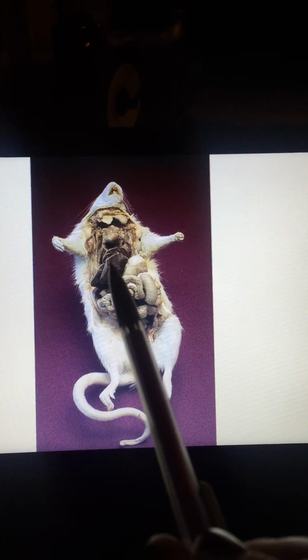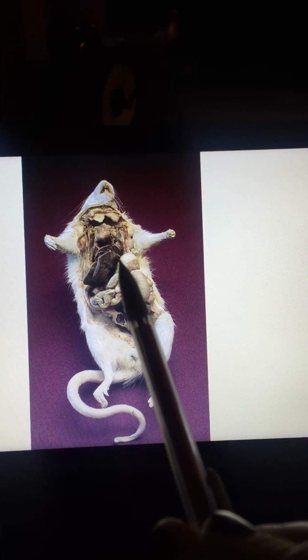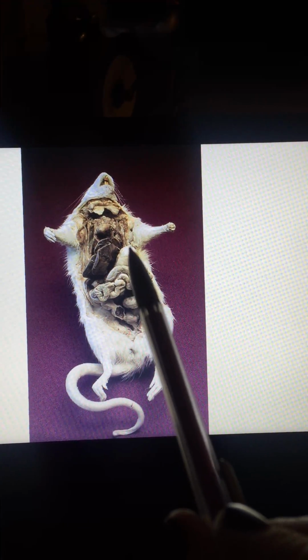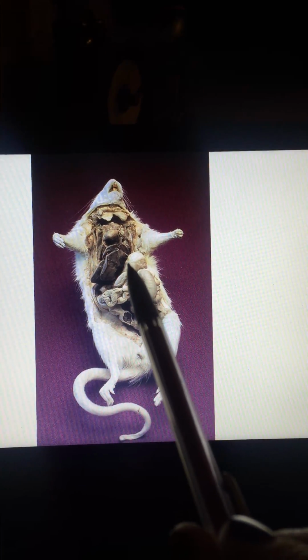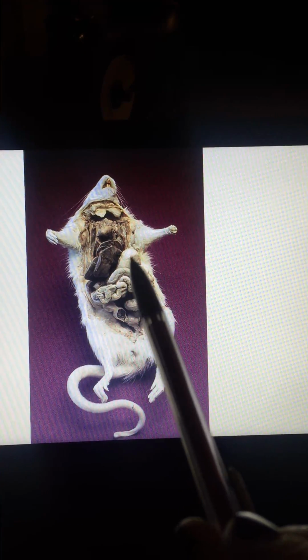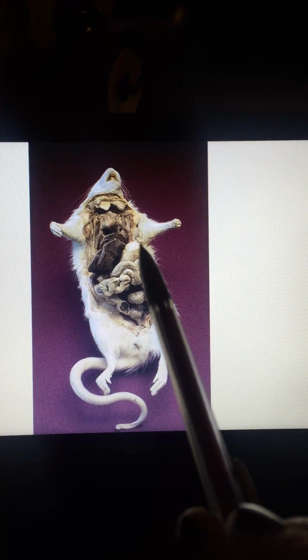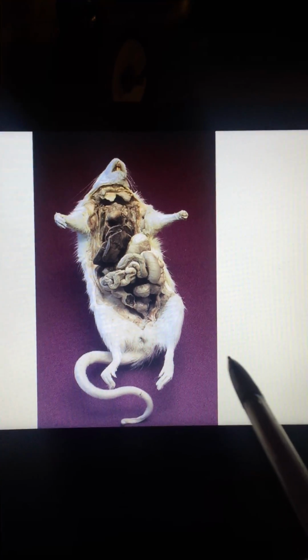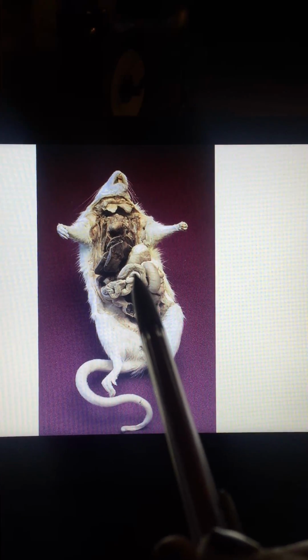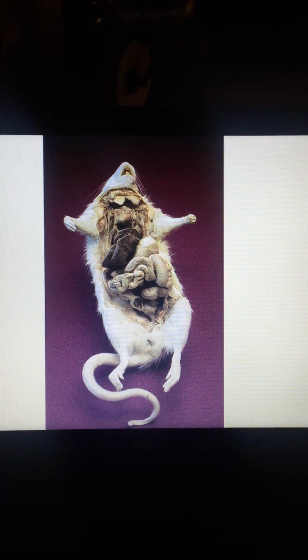On the opposite side, there's a small sac here. You might have to dig around a little bit in your checkout in order to find that sac. But this little sac here, a little bit larger, not as big as the liver, but noticeably bigger, is the stomach, and the job of the stomach is to metabolize or break down food. Then, probably the most obvious parts here, the squiggly tubes. These are your intestines. You have two portions or regions of the intestine, the small intestine and the large intestine.